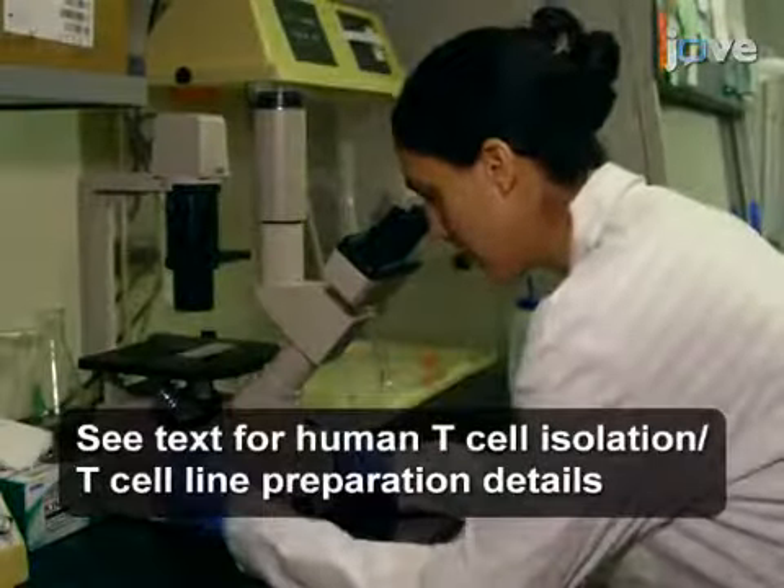After harvesting the T-cells, count and dilute the cell suspension.